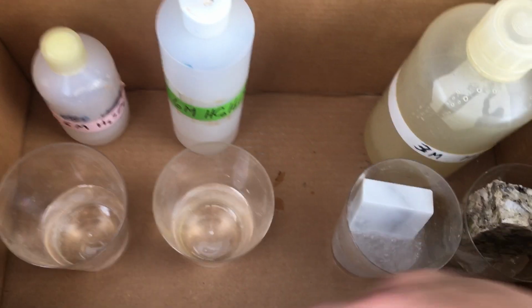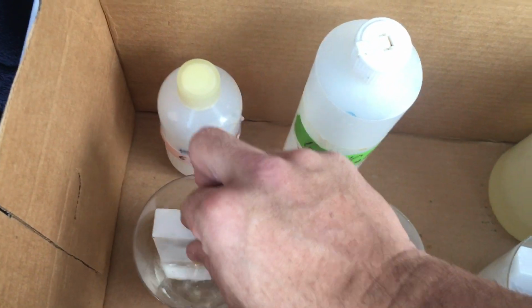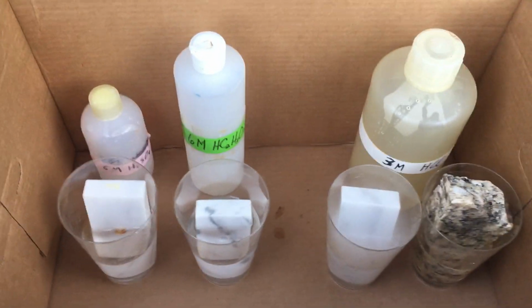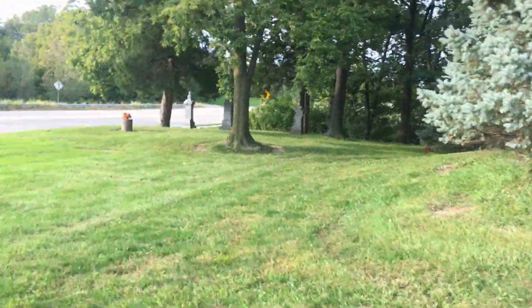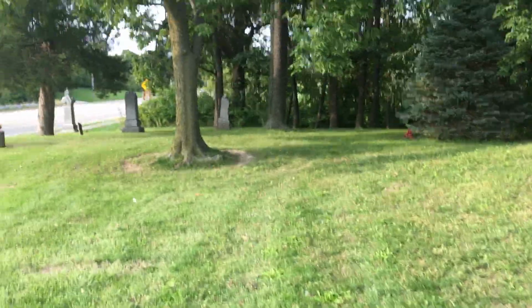Alright, and we're going to put this marble sample into acetic acid and this marble into the sulfuric acid. Alright, we're going to let that go for a little bit, and we're going to take a little walk over to a nearby cemetery and talk a little bit about the chemistry taking place in the headstones of the cemetery.